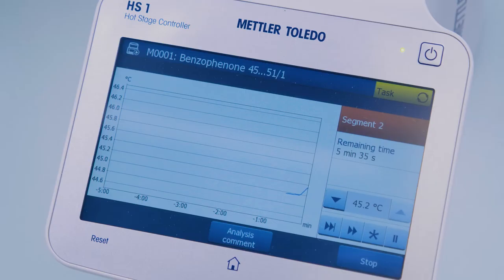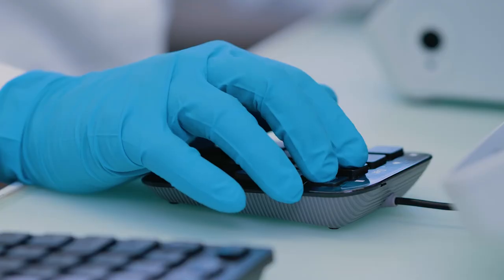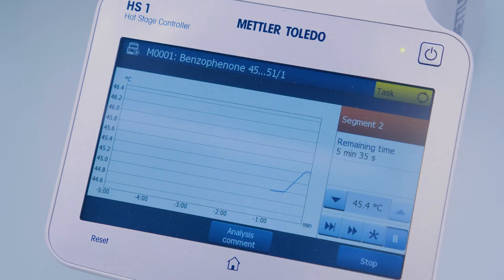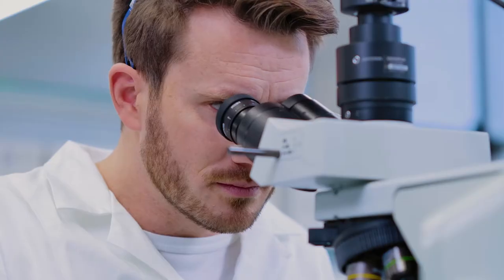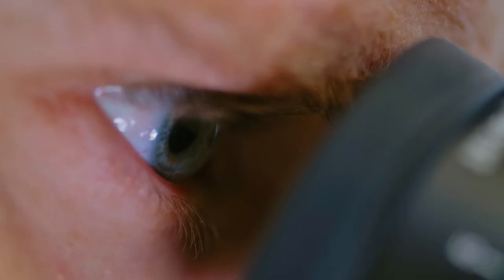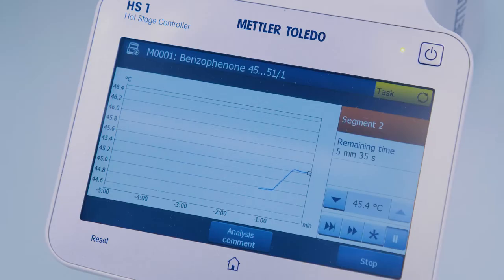During the measurement the temperature program can be stopped, accelerated, or switched to cooling by using the touch screen or keypad. In addition, mark thermal events directly on the temperature curve.